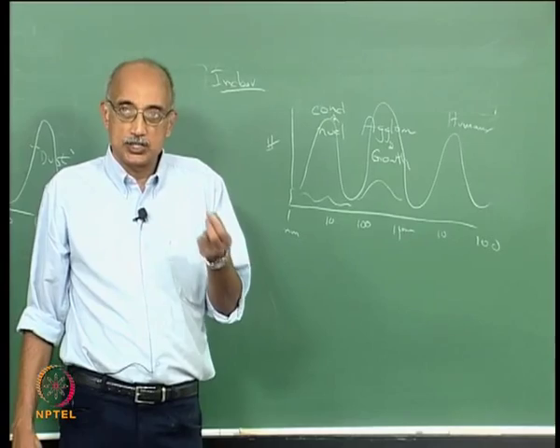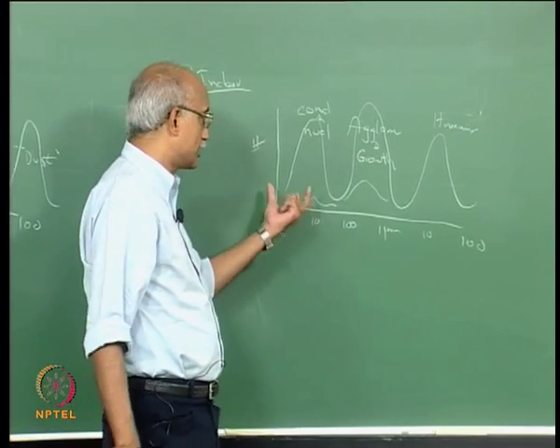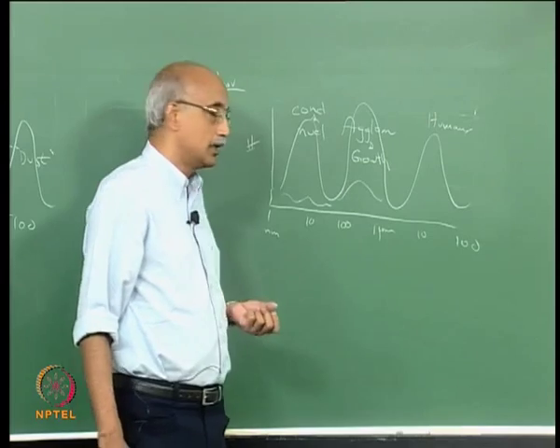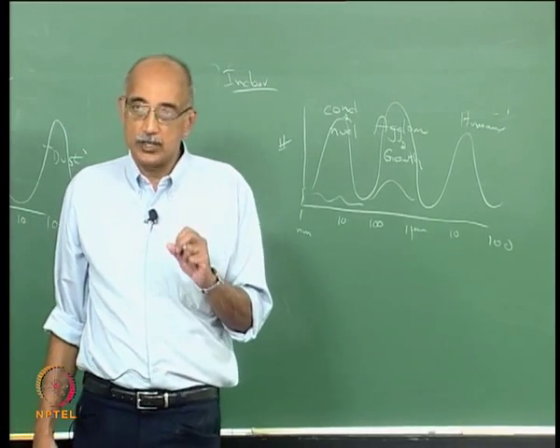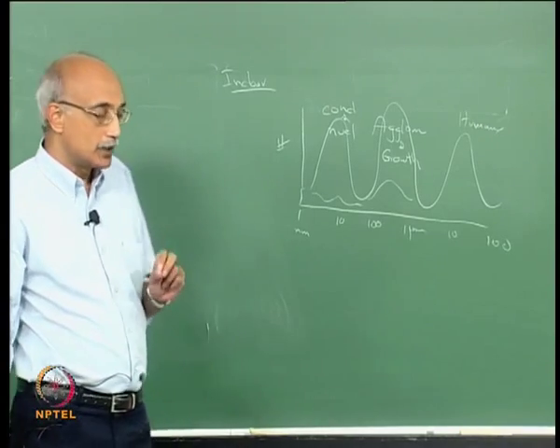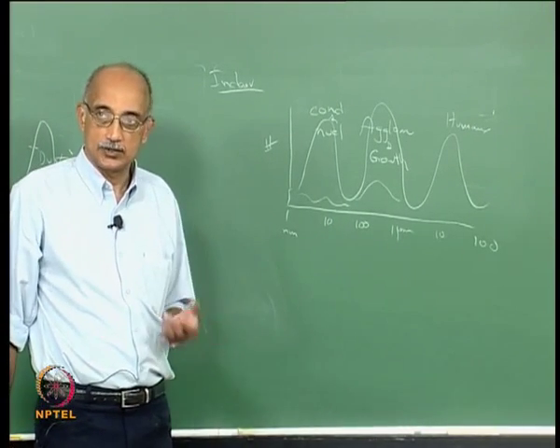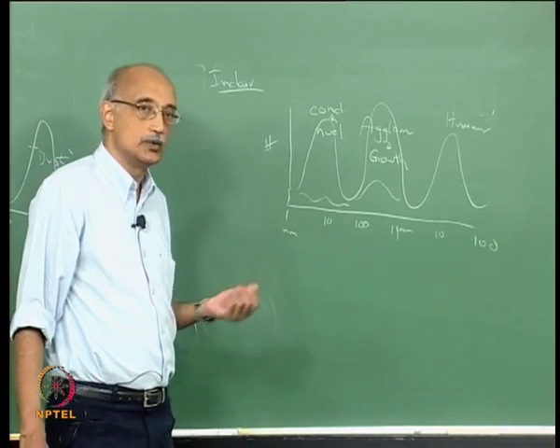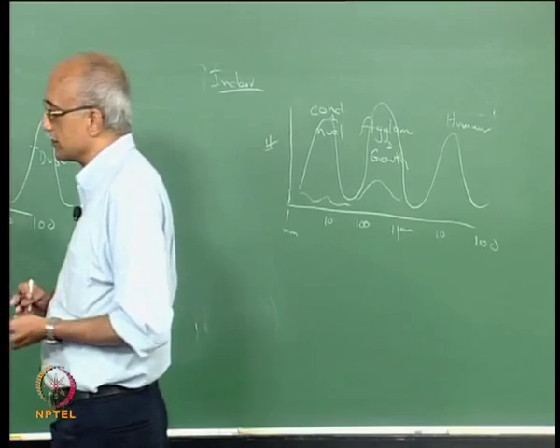You have to be able to measure quantitatively in order to be able to control. So that is why the measurement ability in the sub 100 nanometer size range is very, very important in many, particularly precision manufacturing industries such as semiconductors and so on. So how do you do it? Again, it goes back to the problem that we started talking about earlier.